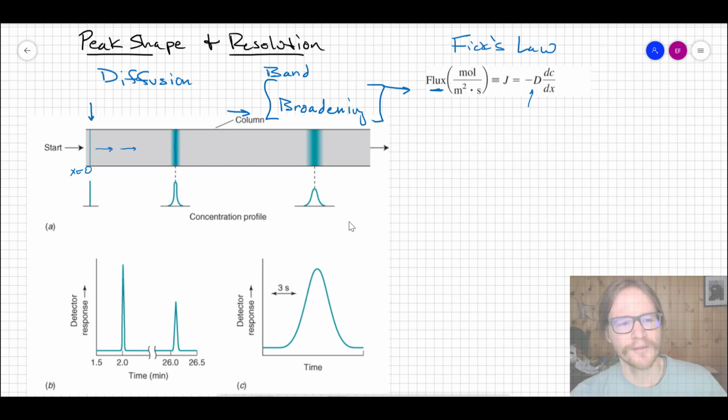And there's going to be a driving force for diffusion in both directions, not just in the direction of the flow. This is the flow direction across the stationary column, with the mobile phase, it doesn't matter. This thing doesn't see flow, it simply sees concentration gradient and then is going to diffuse outwardly in a dimension like this. And what we see at this moment in time, if we were to extract a sort of two-dimensional profile, would be the start of a Gaussian distribution.